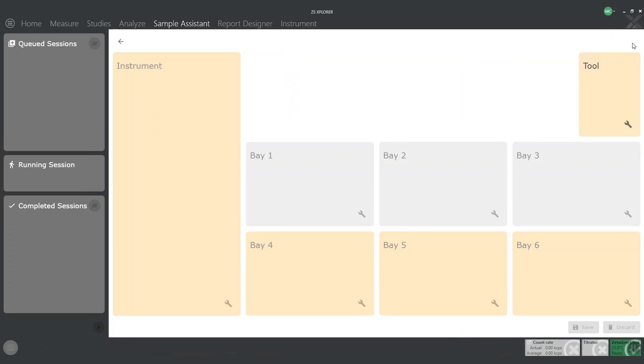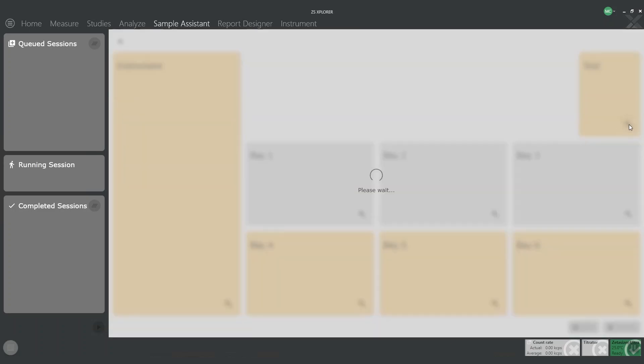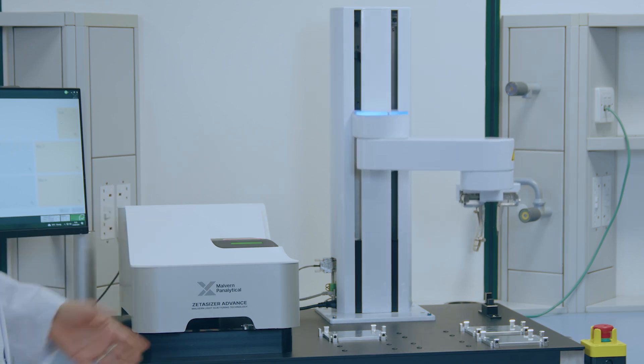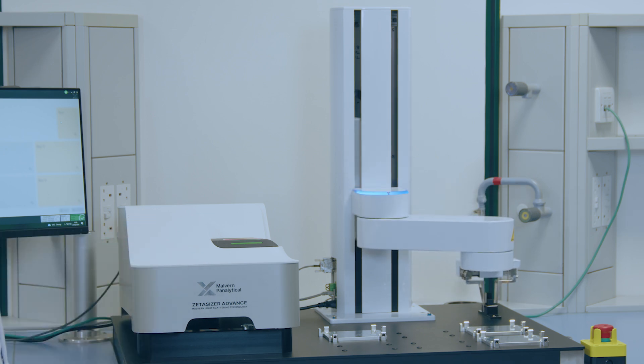The first position that you have to configure is the tool holder position. The reason for this is that the tool holder position serves as master datum for all the other positions that we are going to configure later on. To perform the configuration, simply click the wrench button and the robot arm, as you can see, will start to move and record the position of the tool holder.